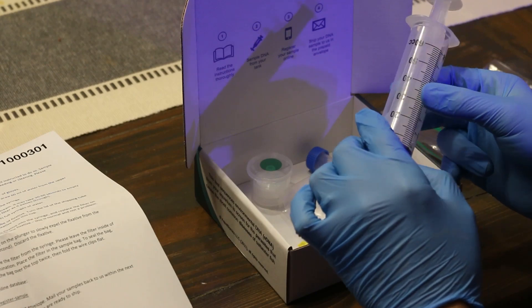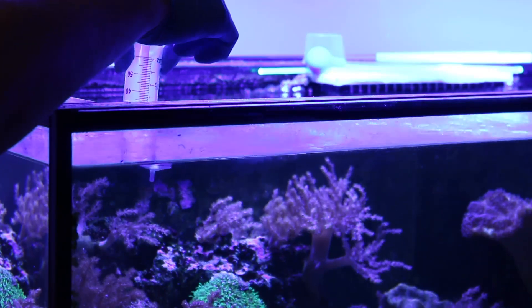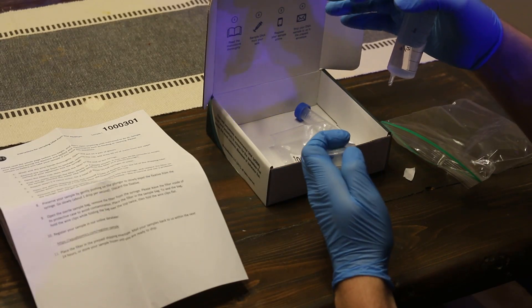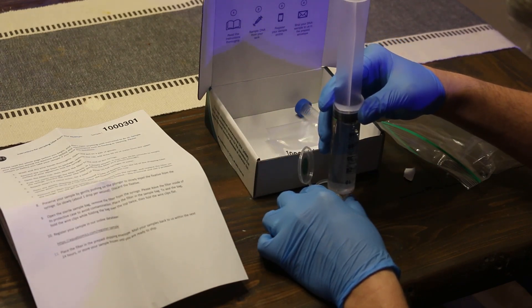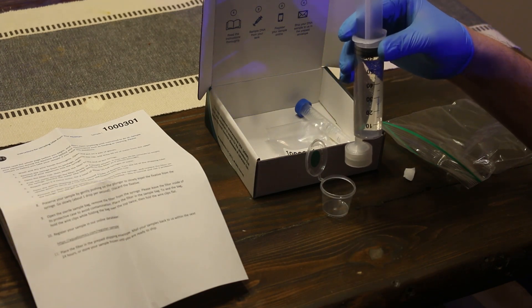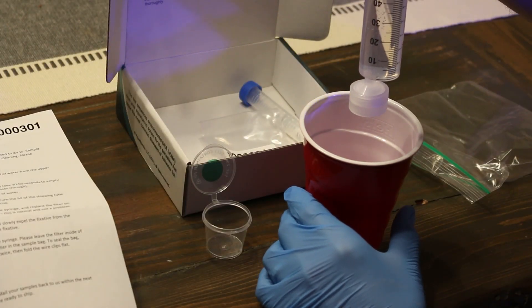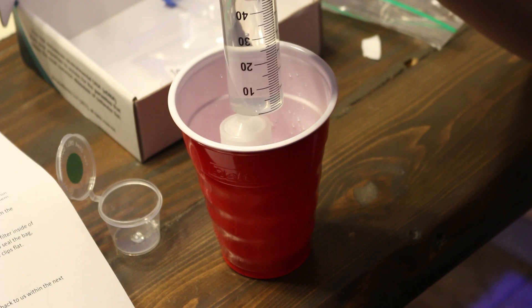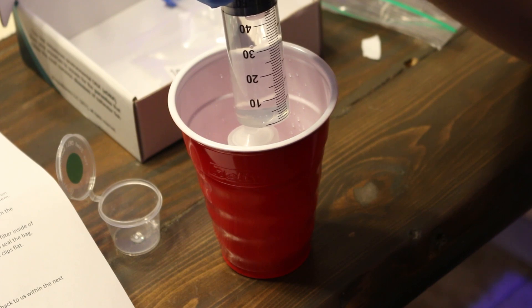Once you remove the syringe from the package, draw 60 milliliters of water from the upper surface of your aquarium. Then open up the filter cup and attach the filter to the end of the syringe — this is what you're going to be pushing the water through. Push the water through the filter very slowly; it may take 30 to 60 seconds or so to empty the syringe. Discard the water at the end — as it passes through the filter, the DNA binds to the filter, and that's how the sample is collected when you send it in.